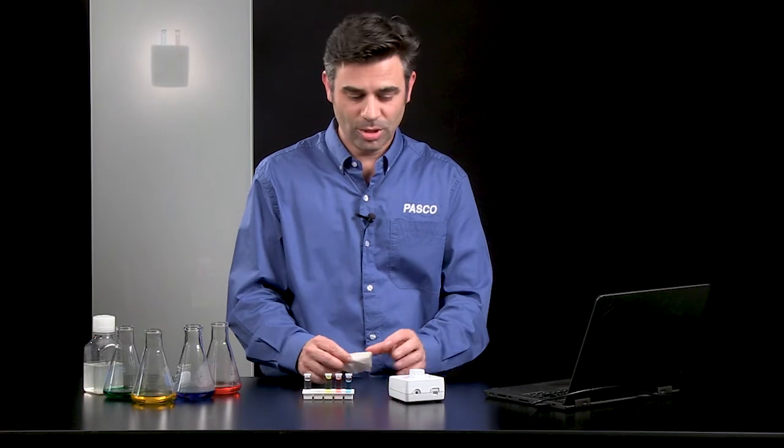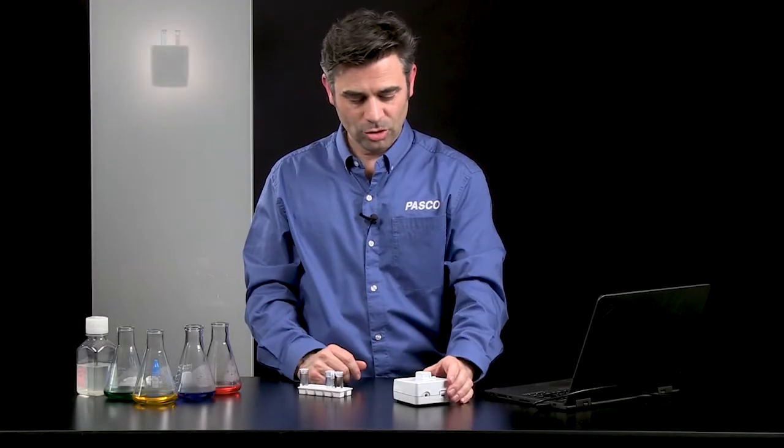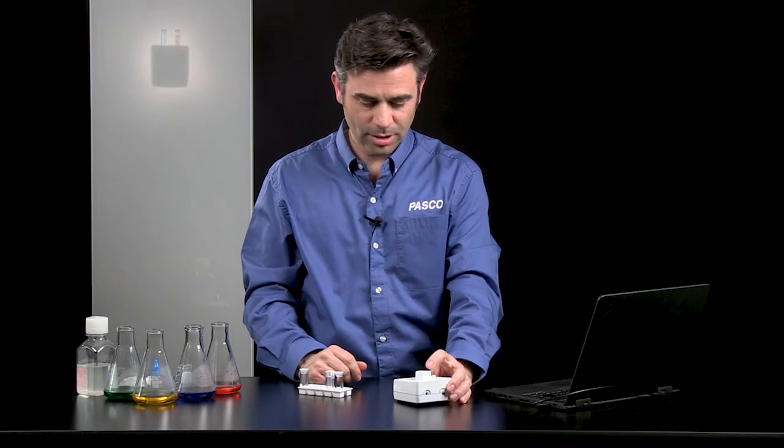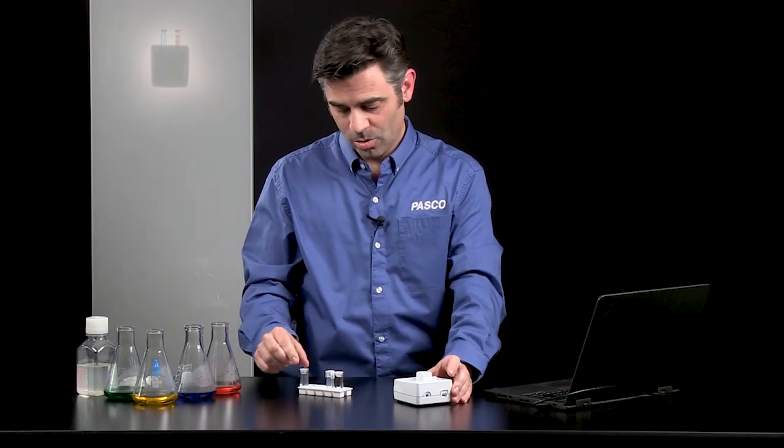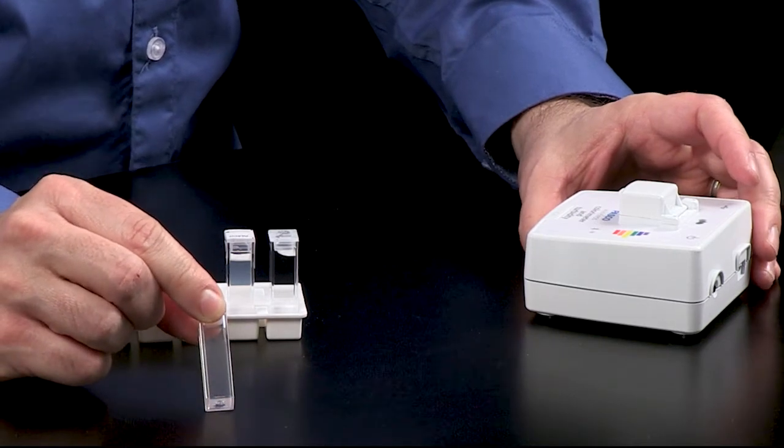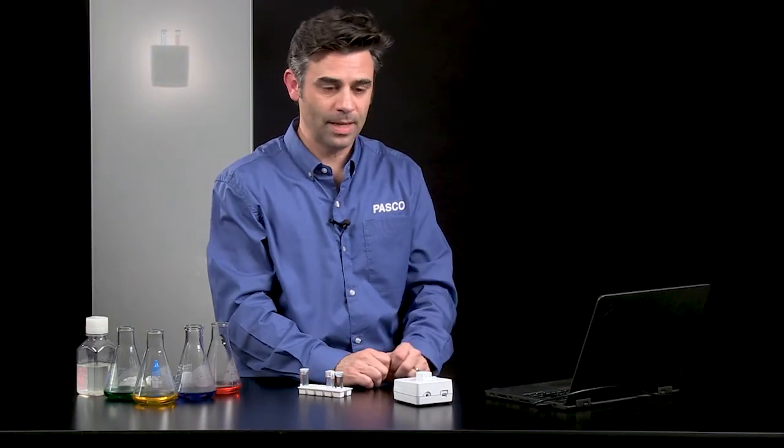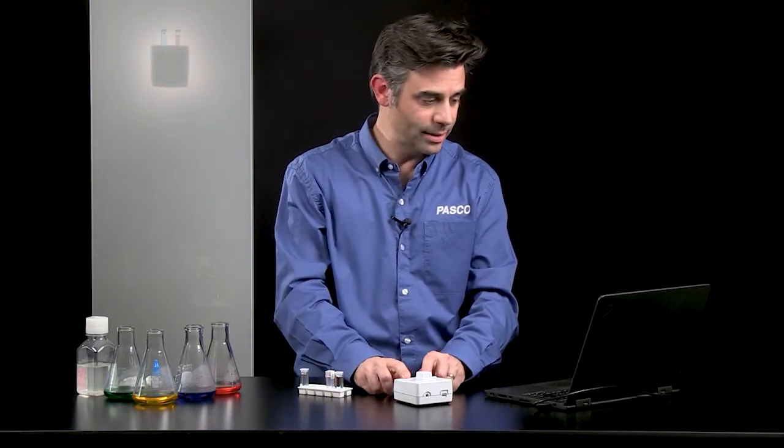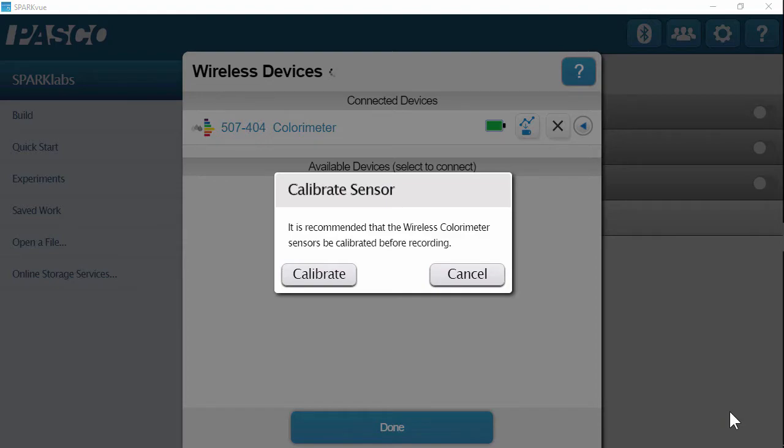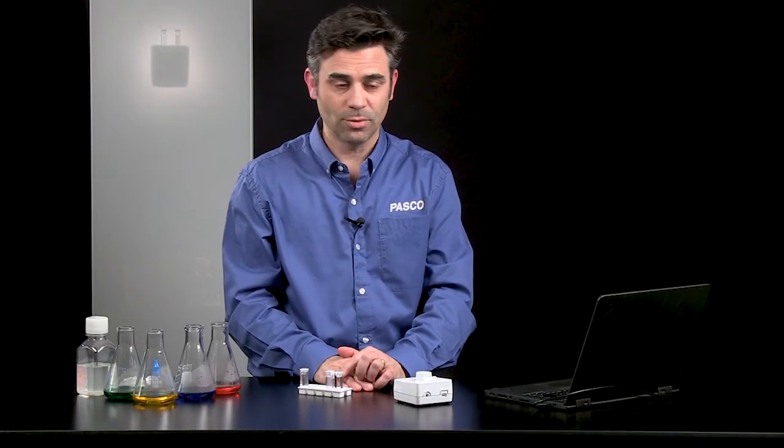All right. So we're going to reset and focus on the turbidity measurement of the wireless colorimeter and turbidity sensor. We're going to try to determine the turbidity of this unknown sample. So to do that, we are going to reconnect our sensor to SparkView. Since we have reset and reconnected, it is going to prompt us to calibrate again. And that's good because calibration for turbidity is just as important as it is for colorimetry.